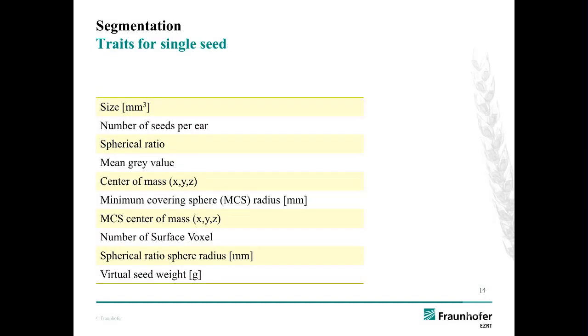So what kind of traits can we calculate from that? With this algorithm, we calculated the size in cubic millimeters.